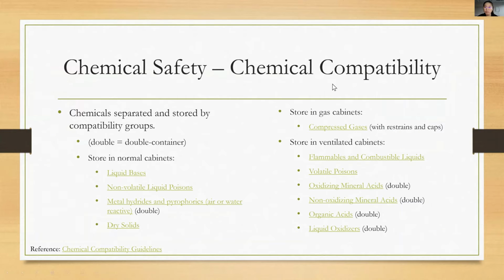So about which chemicals specifically need a secondary container, here I've made a list of the chemical groups. They are classified by their chemical compatibility.